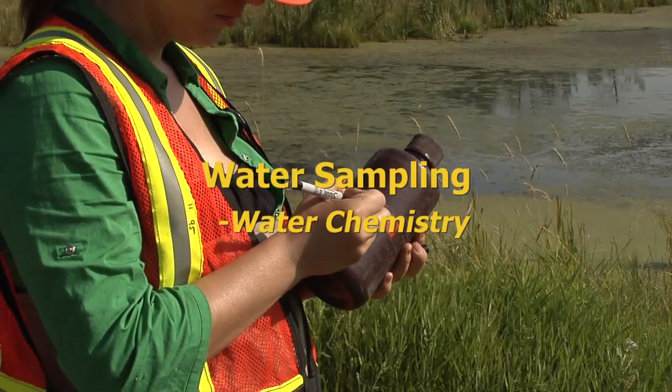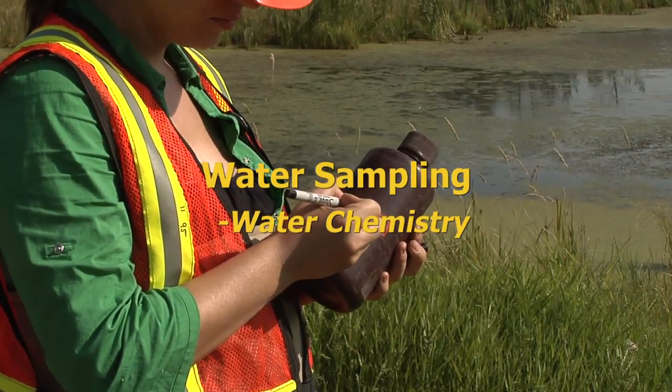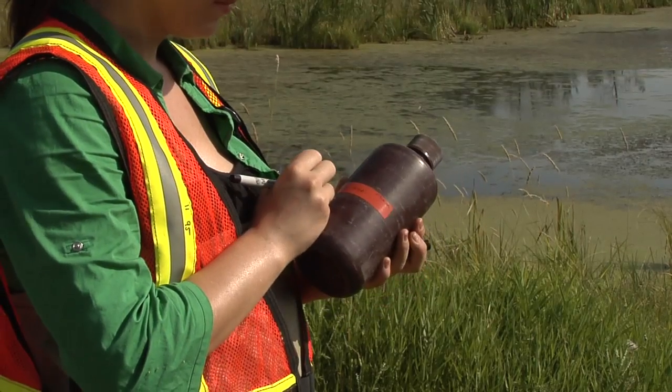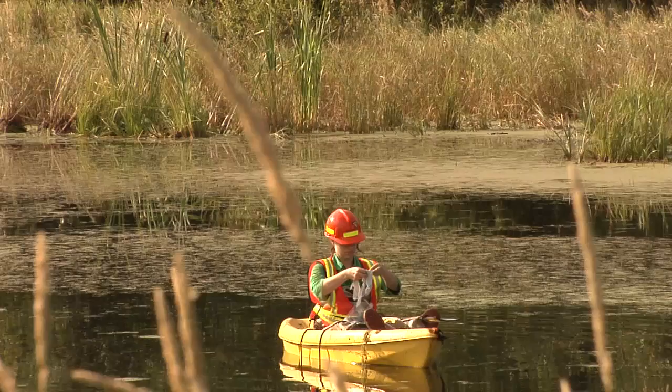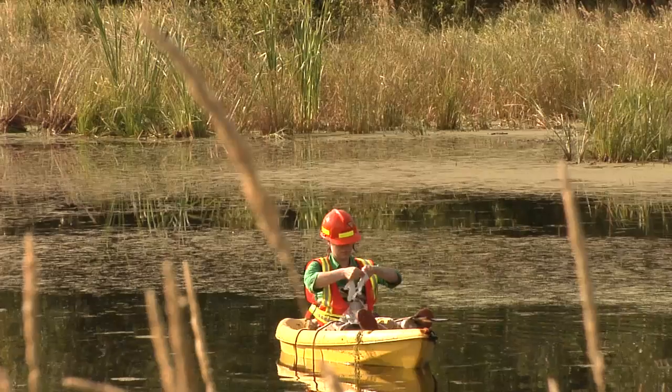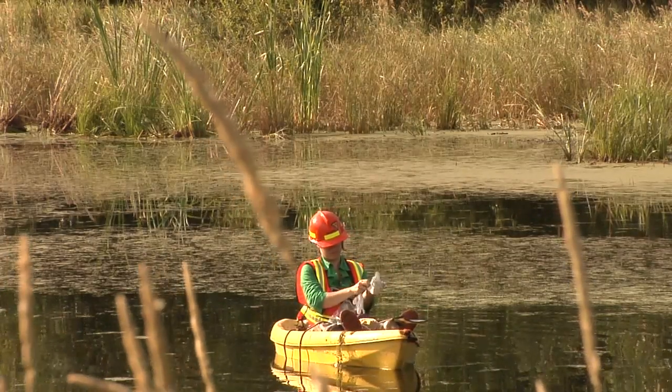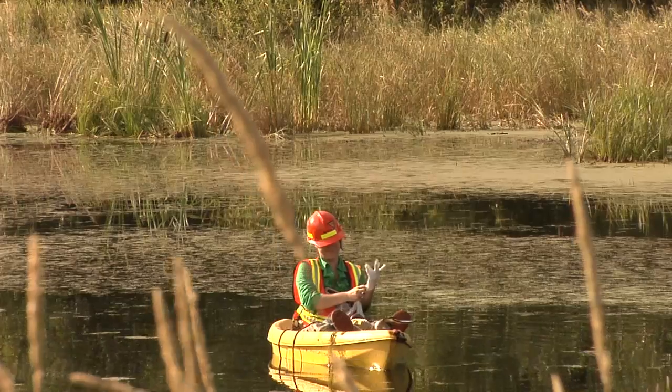A 1-liter water sample is collected in an acid-washed sample bottle. Remember to label the bottle before taking the sample. The sample will be used for lab analysis of nitrogen, a water metric, and chloride, a contamination metric.